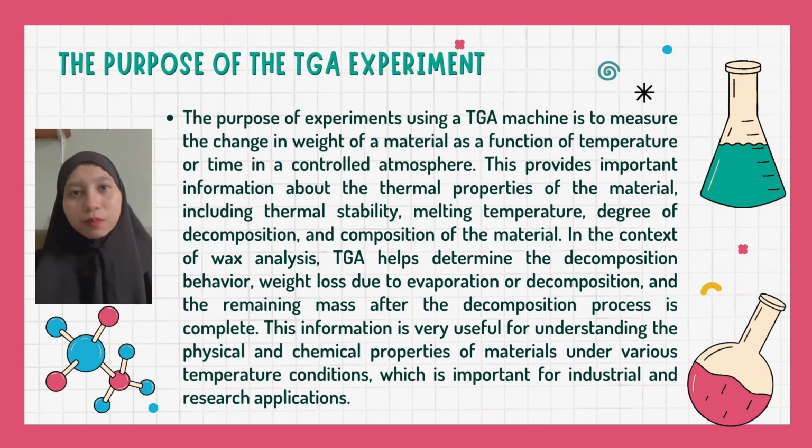Next, I want to explain about the purpose of the TGA experiment. The purpose of experiments using a TGA machine is to measure the change in weight of material as a function of temperature or time in a controlled atmosphere.